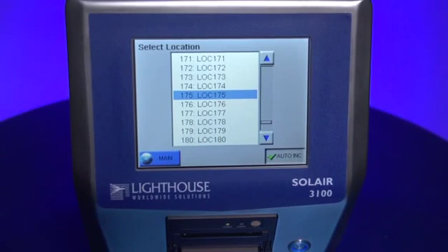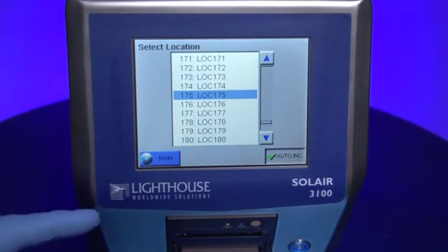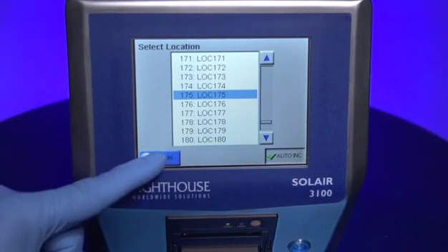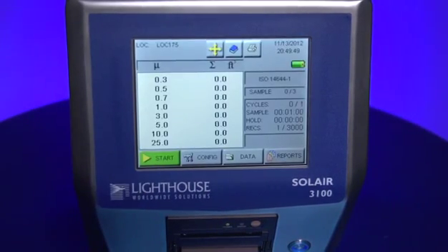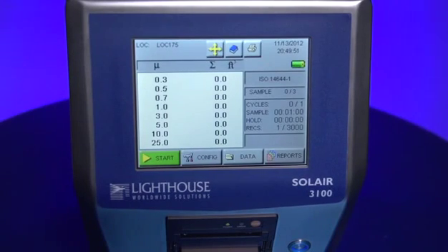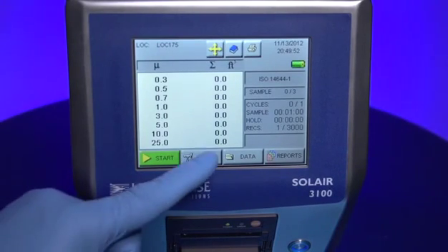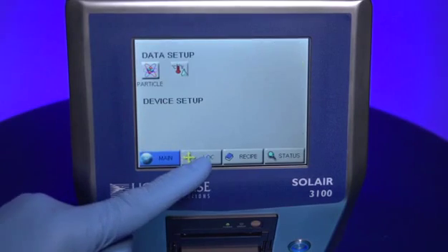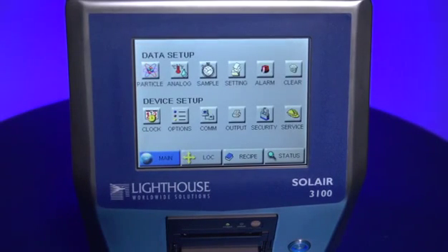You can customize the names of each location. You have 200 sample locations available to you. To customize the names of each location, simply touch the Config button at the bottom of the Home display.